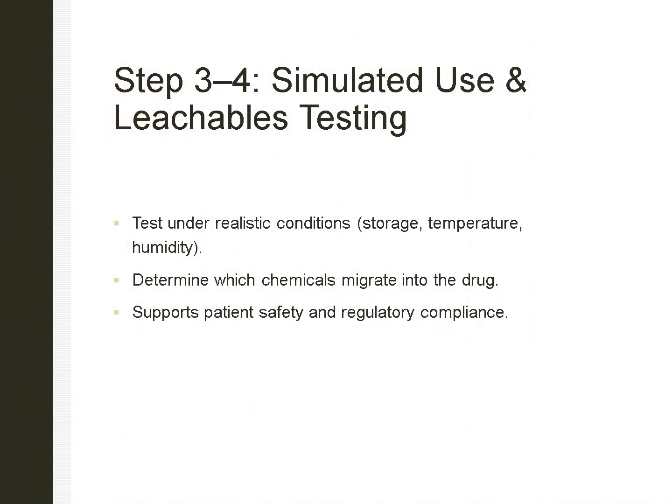Next, we bring the testing closer to reality. We expose the device to real-world conditions, actual drug products, or safe simulants, under realistic temperature, humidity, and storage durations. This helps us understand how materials behave in the real world.